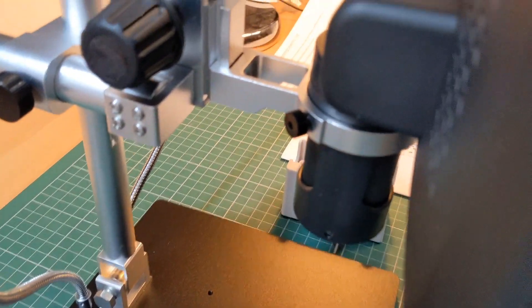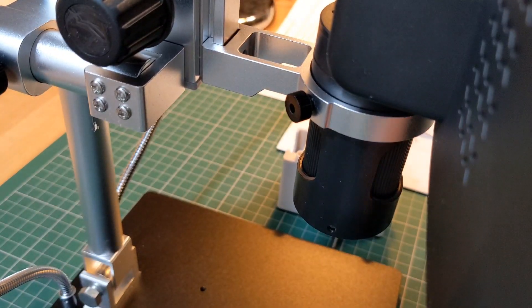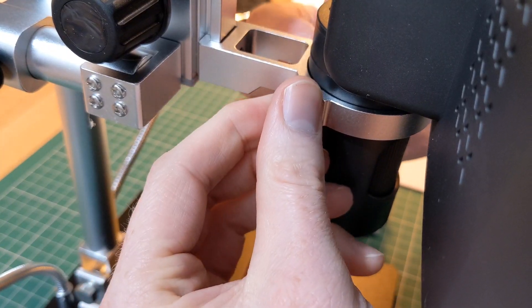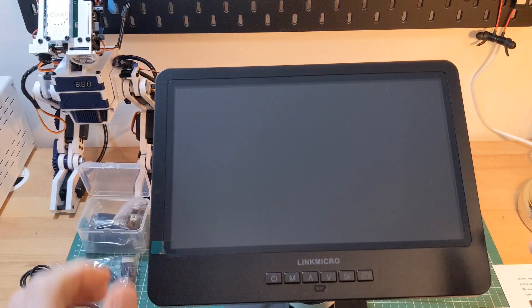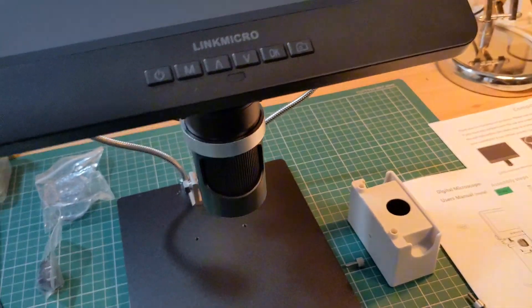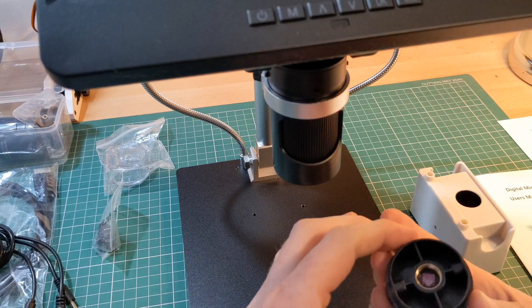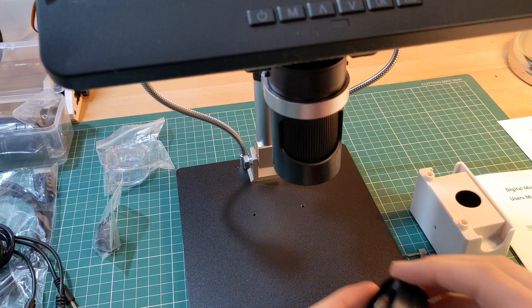It's a little difficult to film this step, but you can see here the attachment point and the screws. Once the microscope is in place, we can reattach the lens and secure with the provided screws.